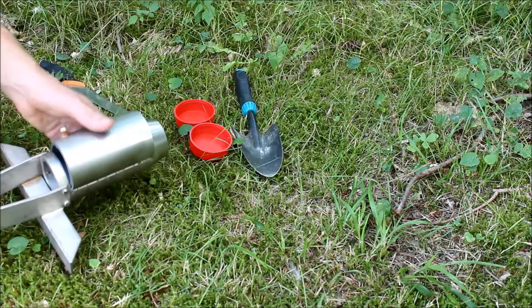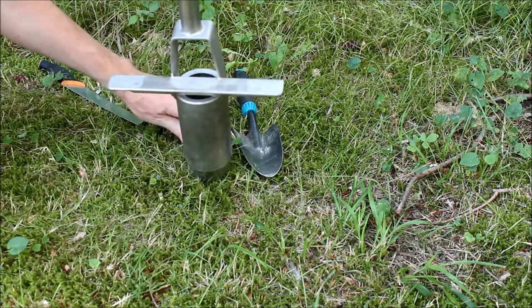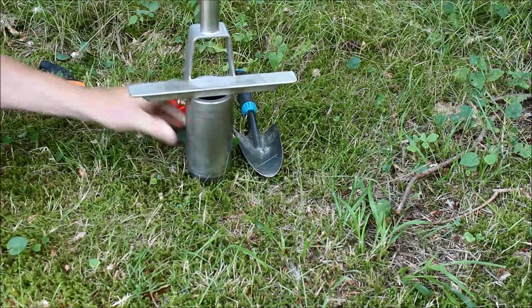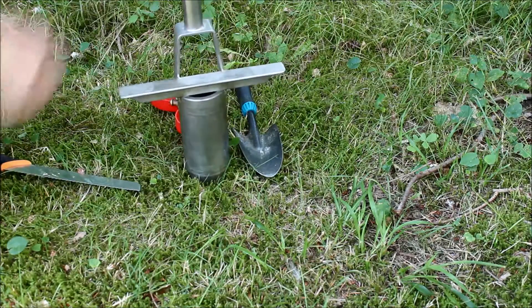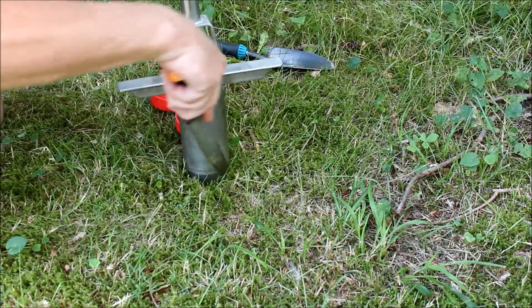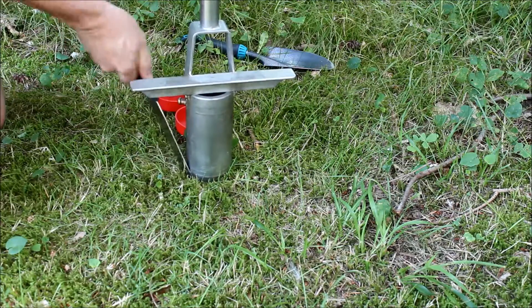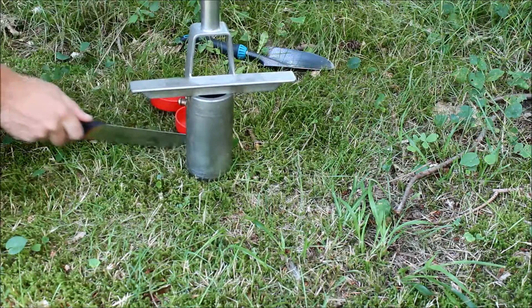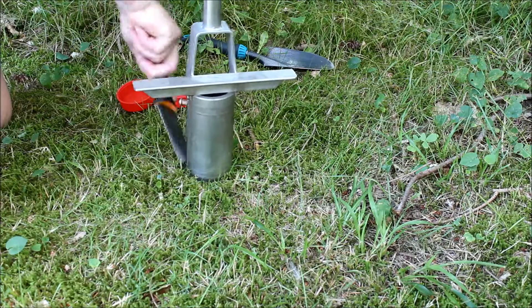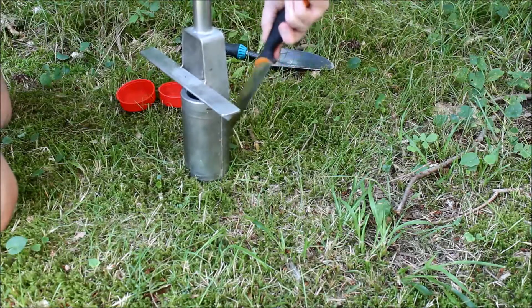In many cases, before taking the sample, it will be necessary to cut along the rim of the soil corer around this cutting edge to ensure that you don't compress soil too much. Compression of the soil is one of the key problems that could occur while taking the sample.